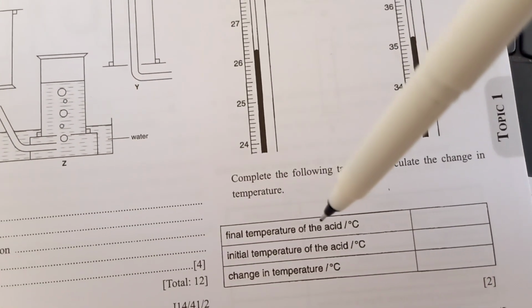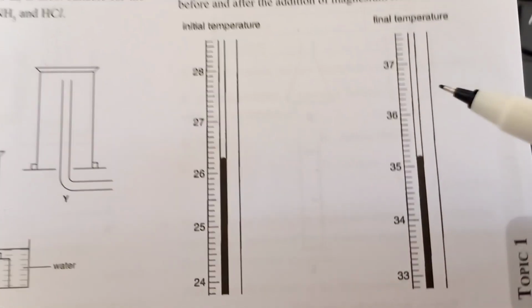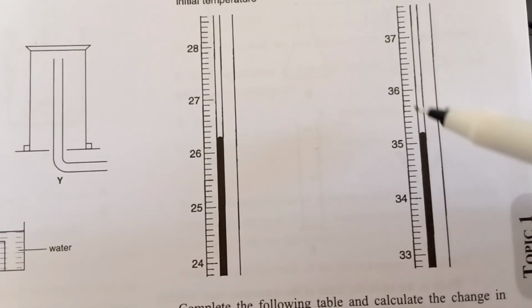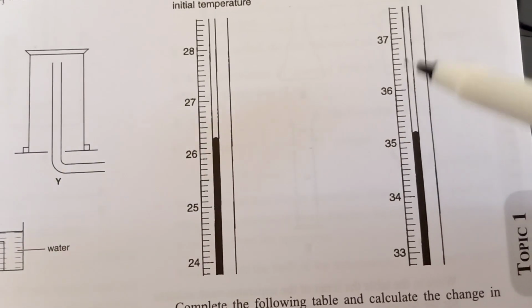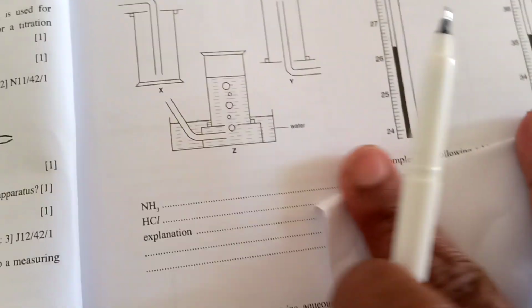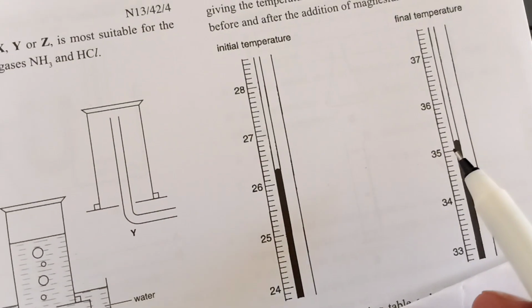Final temperature of acid is 35, 35.1, 35.2. So it is 35.2. Final temperature, final liquid 35.2.